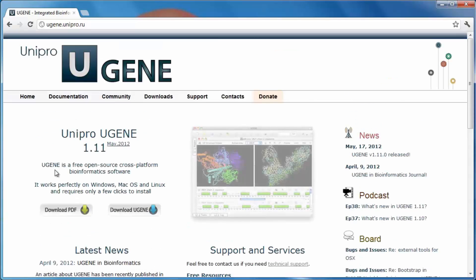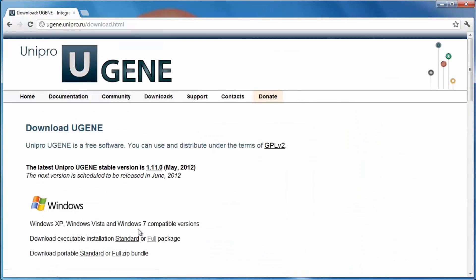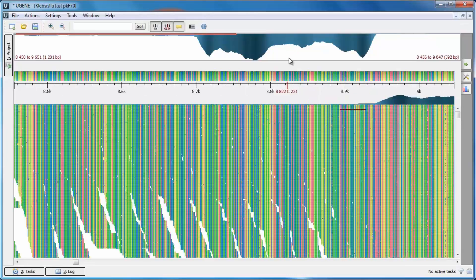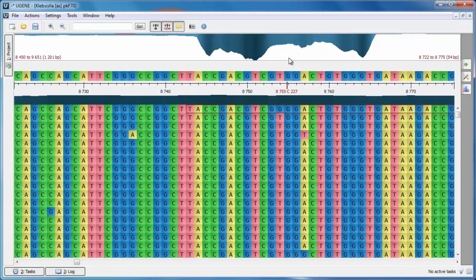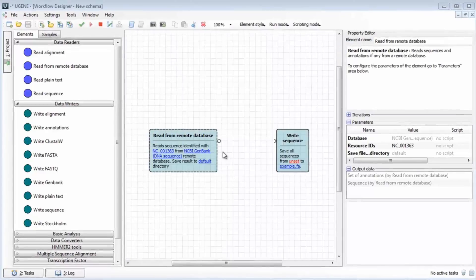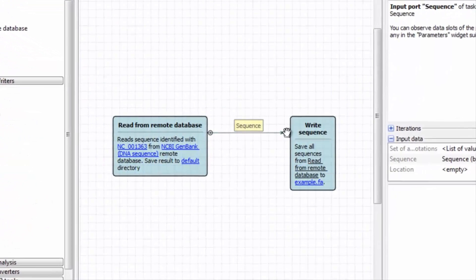Hello, you are watching the UniPro Eugene Podcast. This video is a brief overview of the Eugene 1.16 new features.